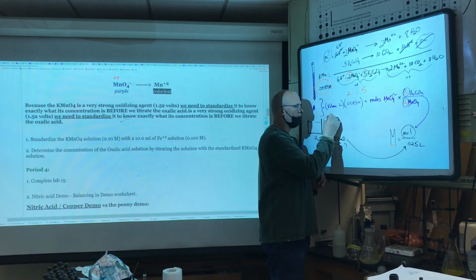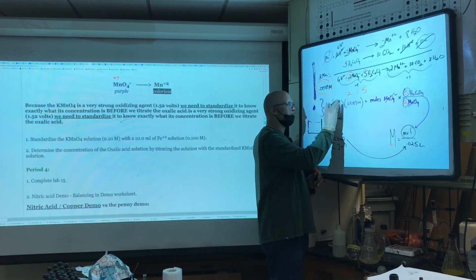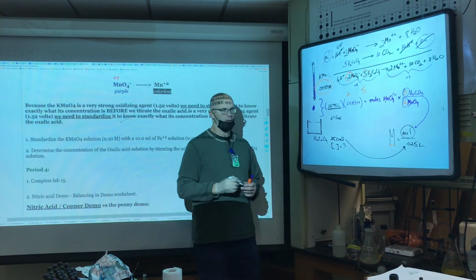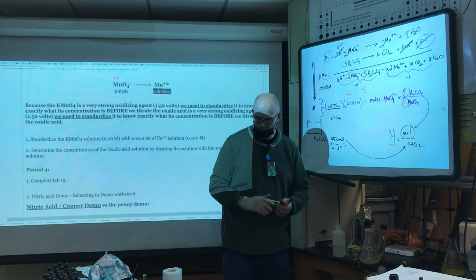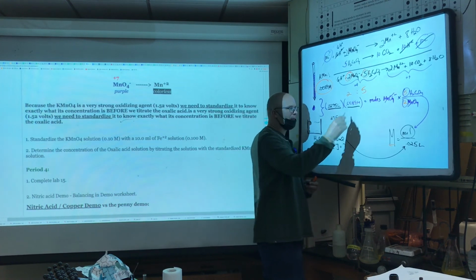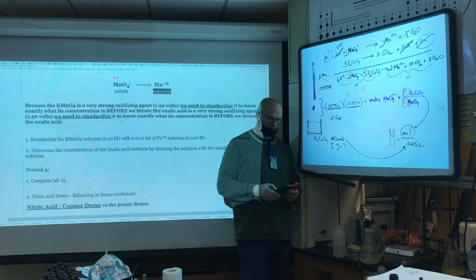27.5. So 27.5 milliliters. Okay, that becomes 0.0275 liters. That's the volume of oxidizing agent you added. This is the molarity that we standardized. I'm going to multiply molarity times liter to get my moles. That's just a classic AP Chem thing that we do.